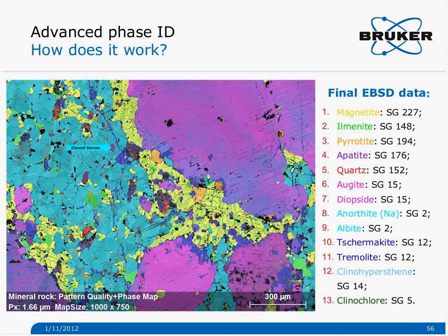Okay, thank you, Dan. Next question. What size will a file containing EBSD and EDS data have? Yeah, I'll take that one. The size will depend on what you save. For example, maybe one of the questions you might have in mind right now would be, will I be forced to save the patterns all the time?